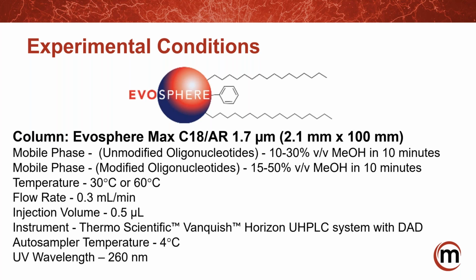If the analytes have log P's of -4, 5, 6, sure, you're going to need HILIC. The problem with HILIC is you can have retention shifts, and people get really anxious about sending a HILIC method to QC, so they're always trying to redevelop it. But for research, 100%, HILIC is definitely the way to go, at least to get a full understanding of what's in your sample.